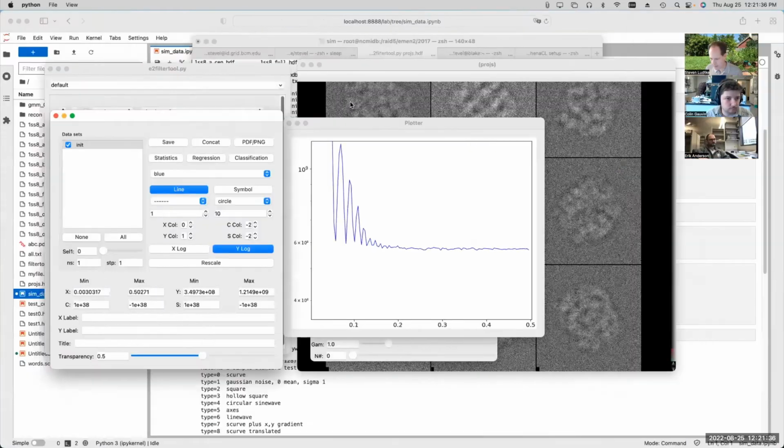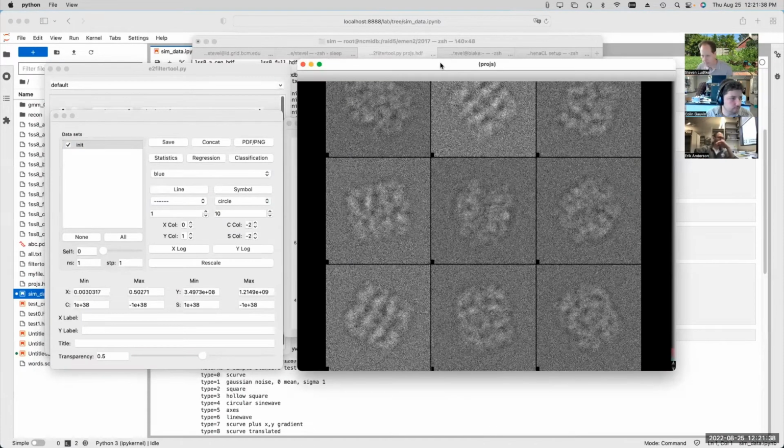What impact does that have? So back to our simulation again here. We've got our simulated data here. And what we did is we took a PDB file and we turned that into a pseudo electron density map by putting Gaussians where all the atoms are. Then we performed a CTF filter and we added noise.